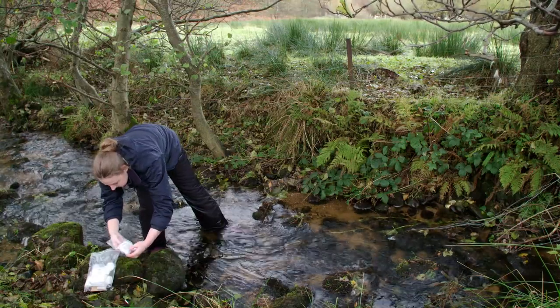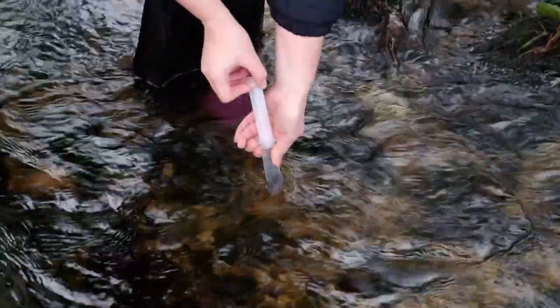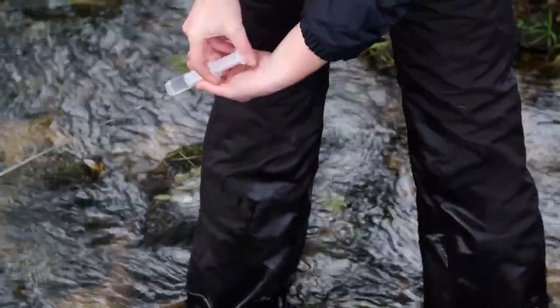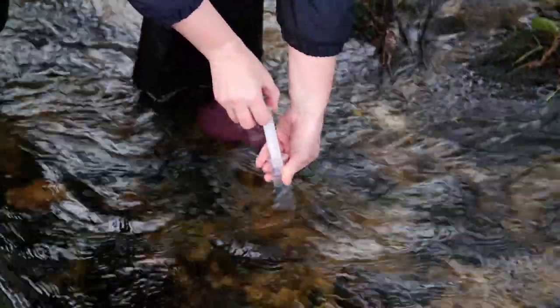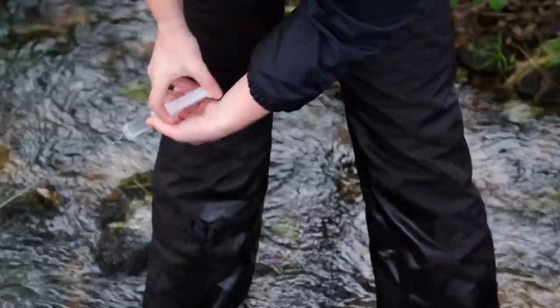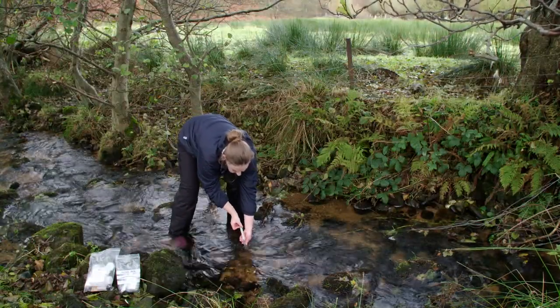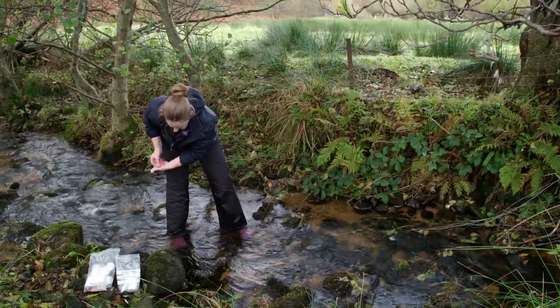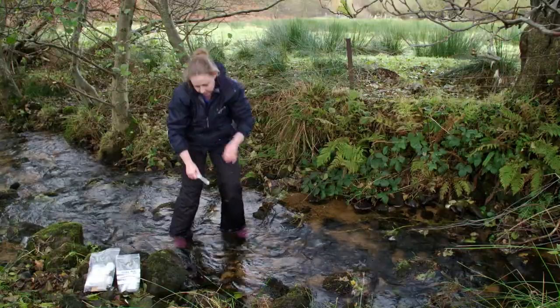Remove a syringe from the polybag and rinse it in the stream. To rinse the syringe, fill it with water and dispose of the water downstream. This process should be carried out three times. Once this is done, fill the syringe up again and be ready to begin sampling.